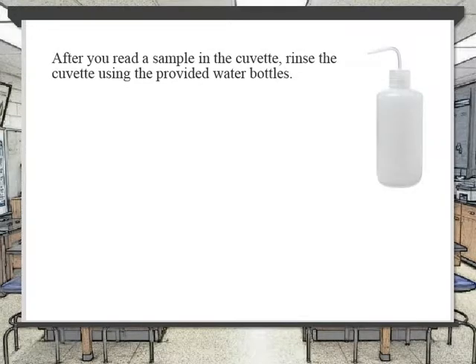After you read a sample in the cuvette, you will rinse the cuvette using the provided water bottles. You will be reusing the cuvettes, so you will want to shake out any remaining water droplets before you add the next sample.